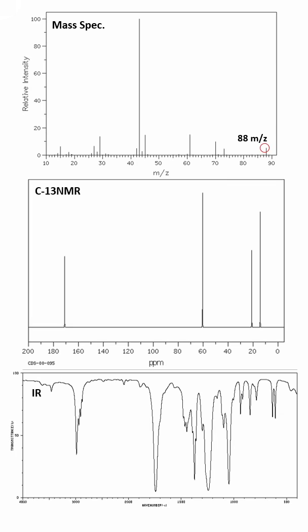right at 88 m/z. That's going to mean that the molecule has a molar mass of 88 grams per mole. We see there is a peak here at 43. That is most likely from a fragment. Here, that is 3 carbons in a row. And then we have a peak at 29 that is from the 2-carbon fragment, or 2 carbons and 5 hydrogens.